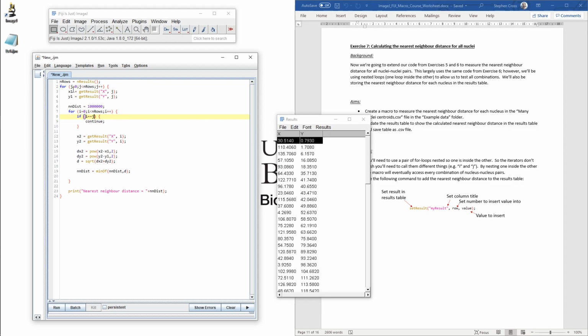And that's it. So then we're going to calculate the number of rows, go here, j is equal to 0, pull out that first row, assign a new ridiculously large nearest neighbour distance, iterate over all of the other rows, check that the current count isn't equal to our j row that we're pulling out, so starting off with 0, calculate the distance, and then print.